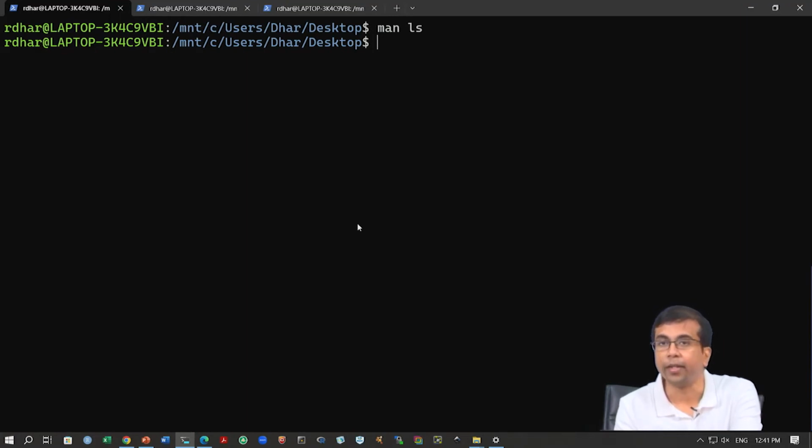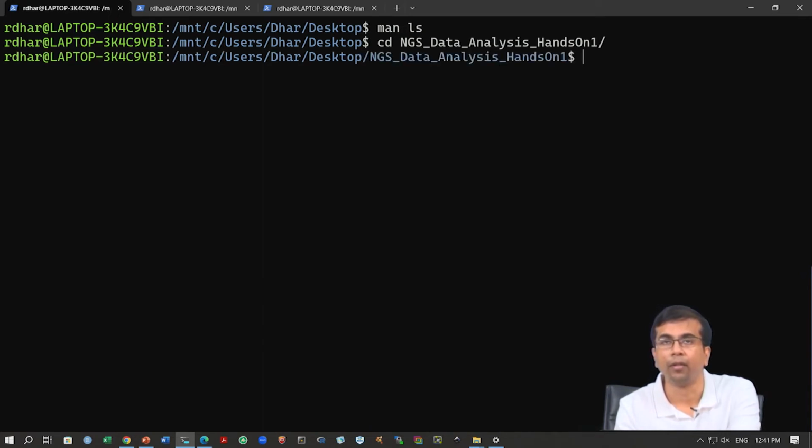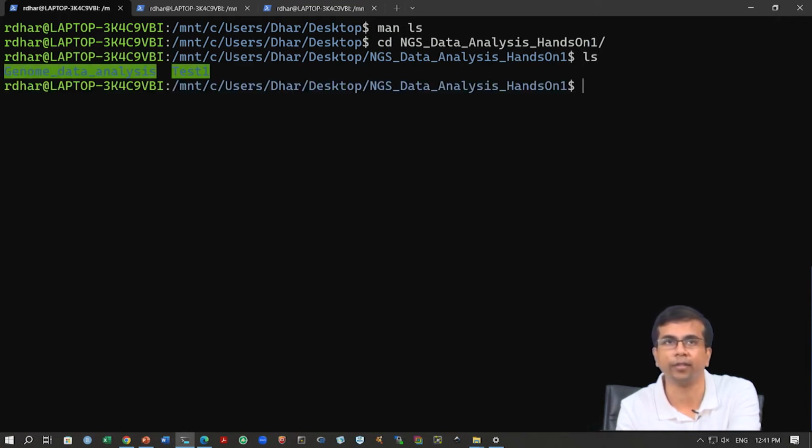All right. So, we are here and I have actually created on the desktop a folder called NGS data analysis hands-on 1. Okay. So, let us now move into that directory, and we will use the command ls just to see what is there. Okay, so we have the genome data analysis folder and we have the test1 folder. So we have two subfolders inside this NGS data analysis hands-on 1 folder.